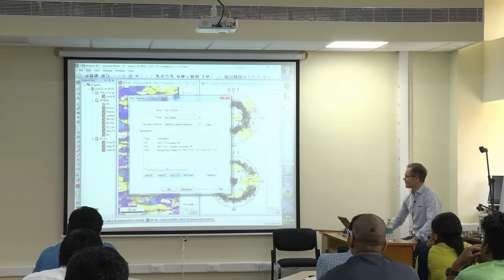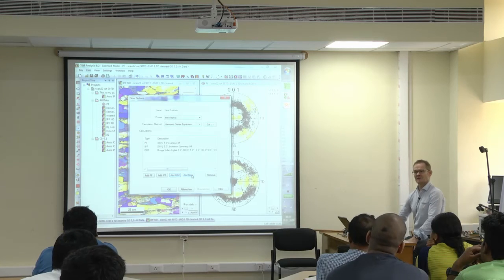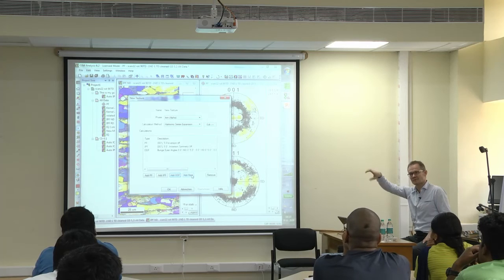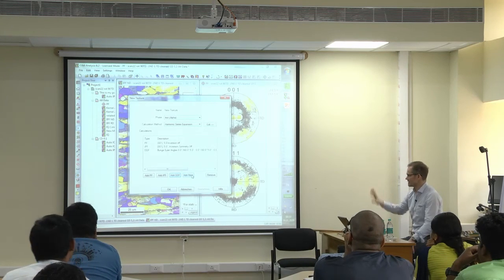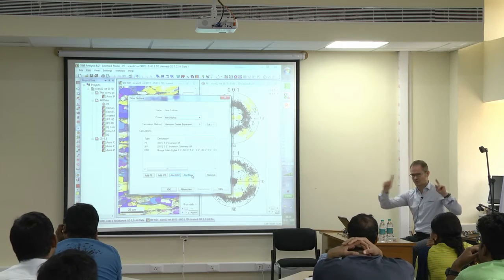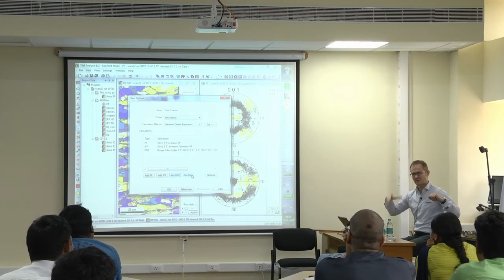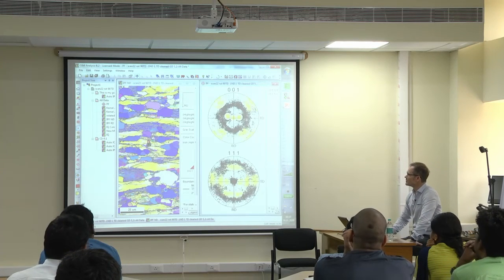Okay. Oh, you could also calculate the fibers. That means the intensity along these rotations which I have shown you, no? The 111 rotating along ND, or the 100 rotating about RD. I think we could speak just about this example for the next 3 days until you have absorbed all the possibilities. But I just do it now for these few minutes.